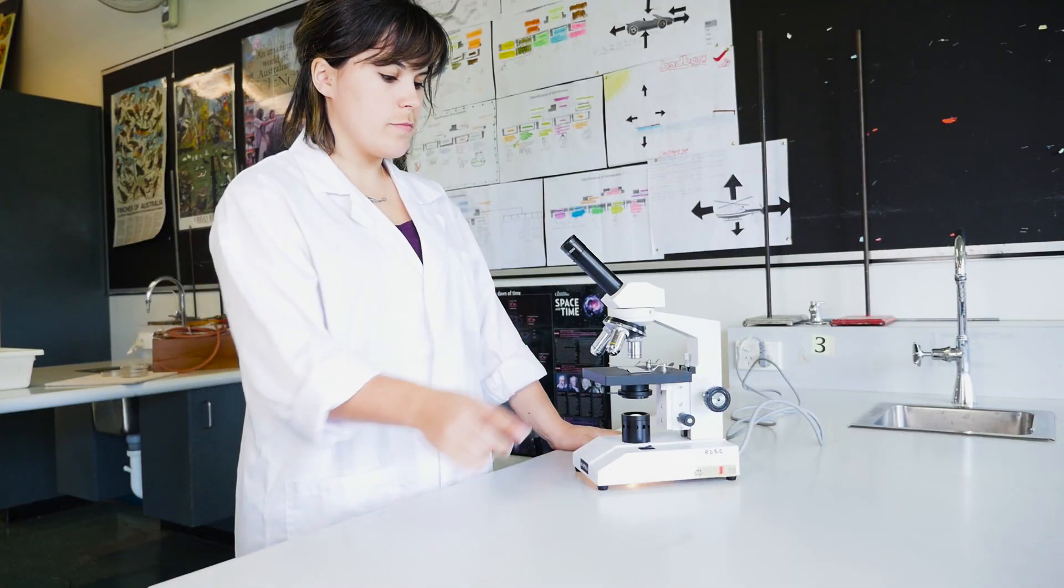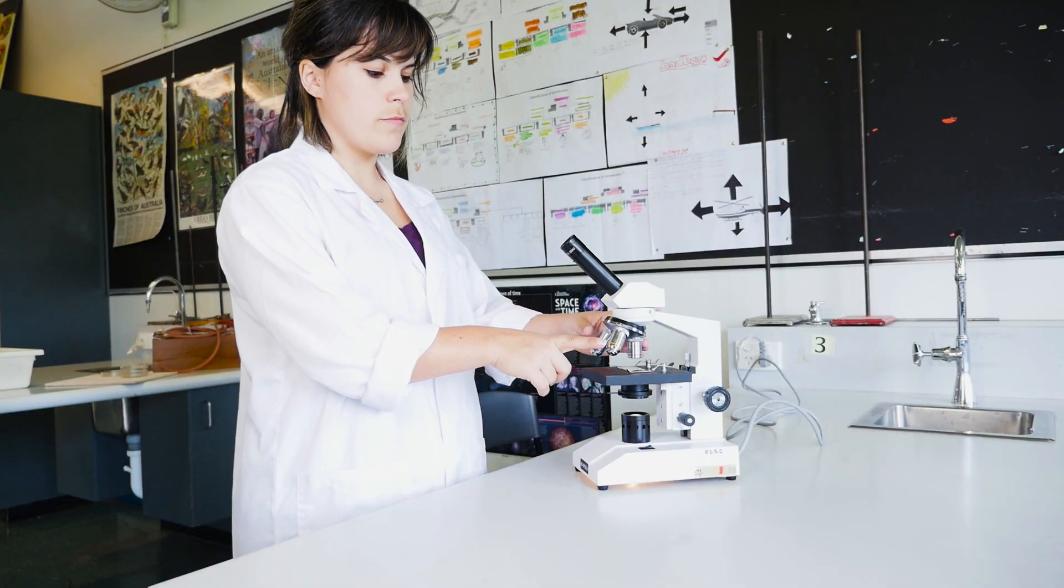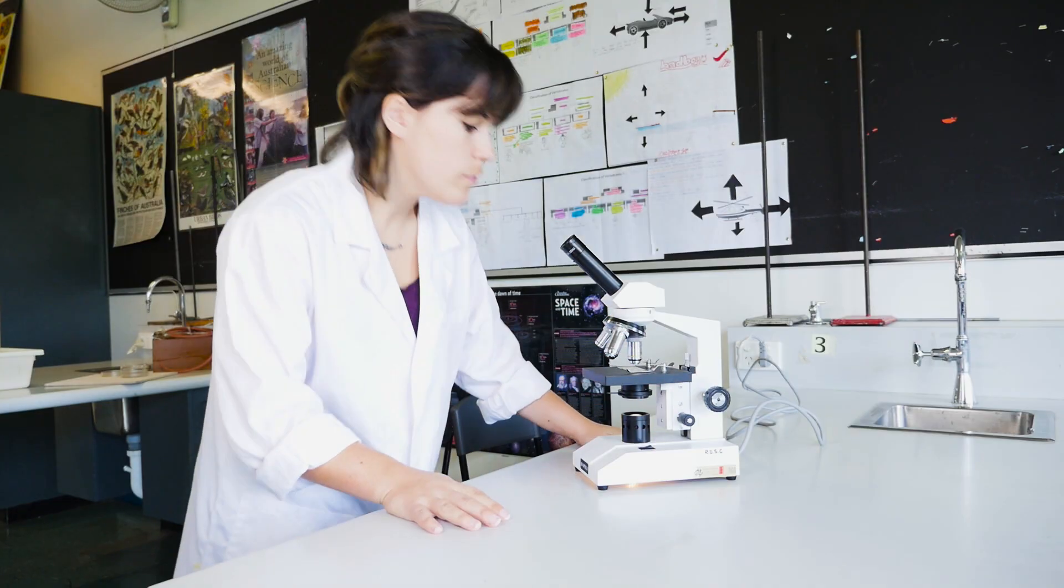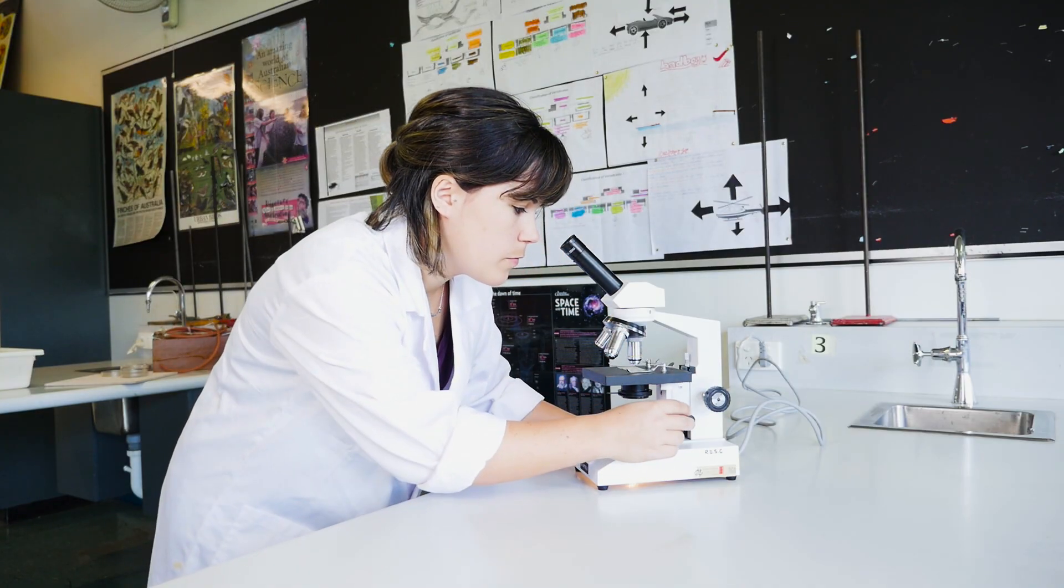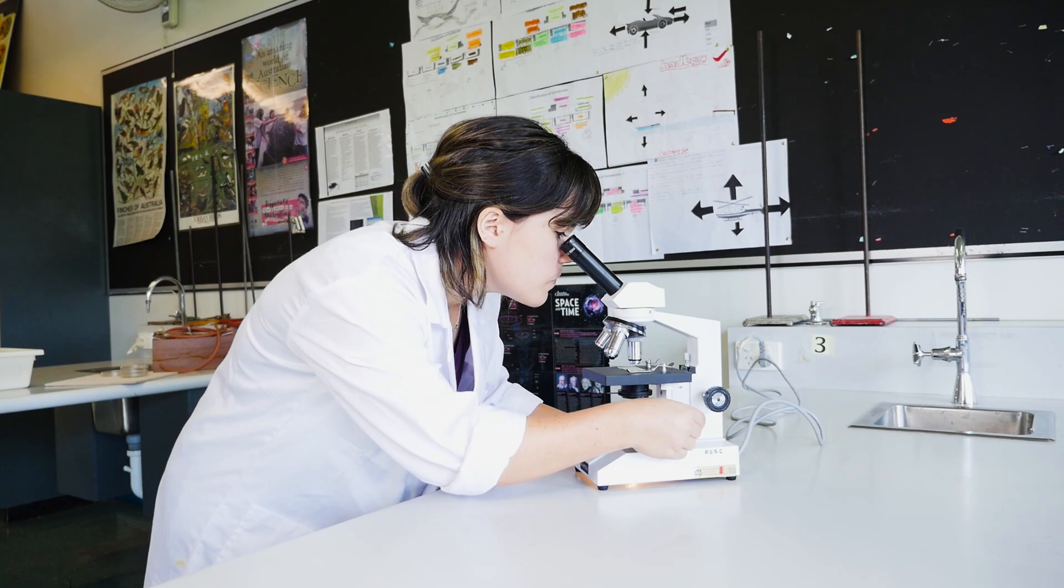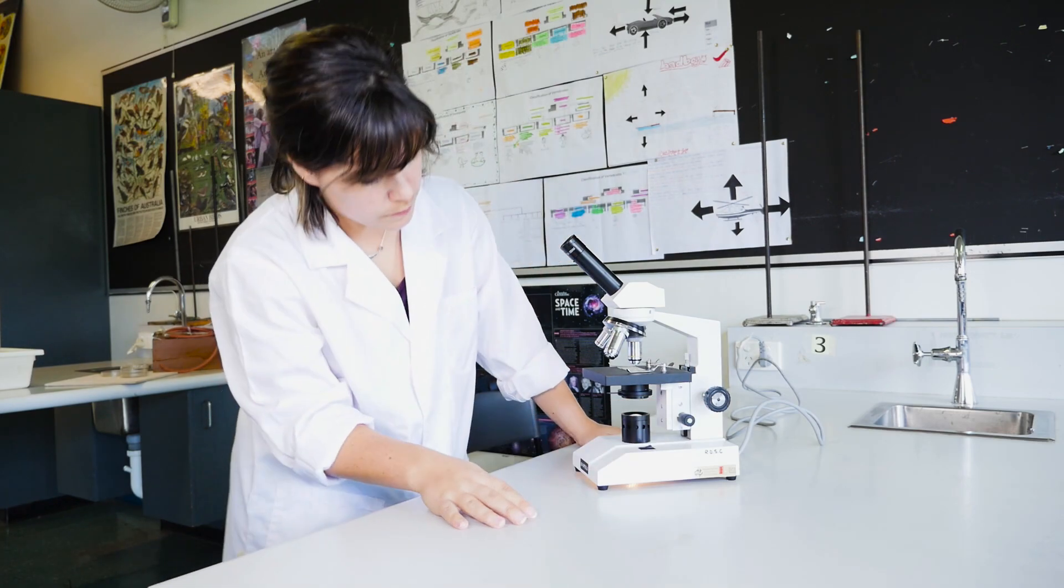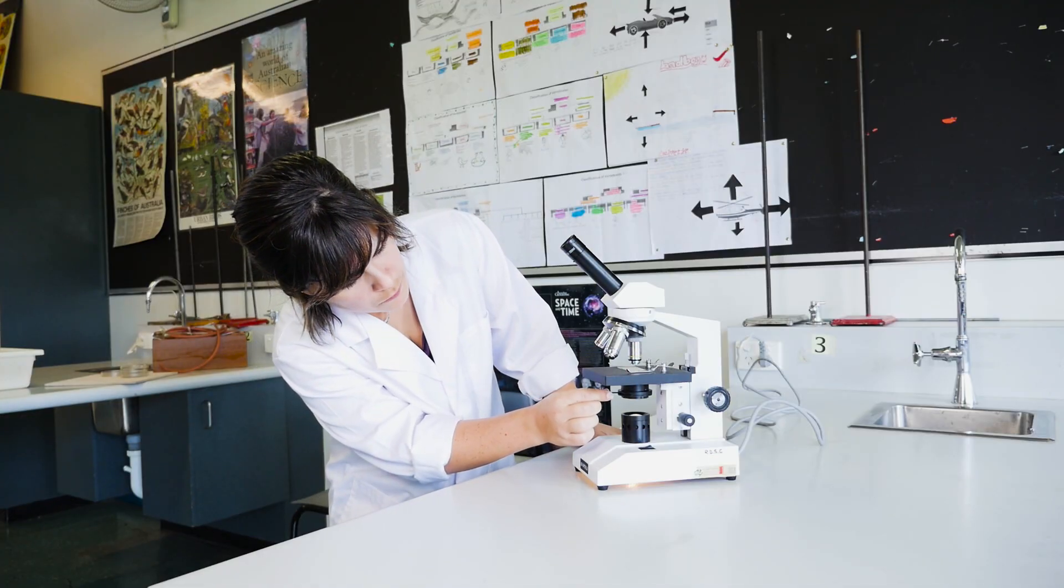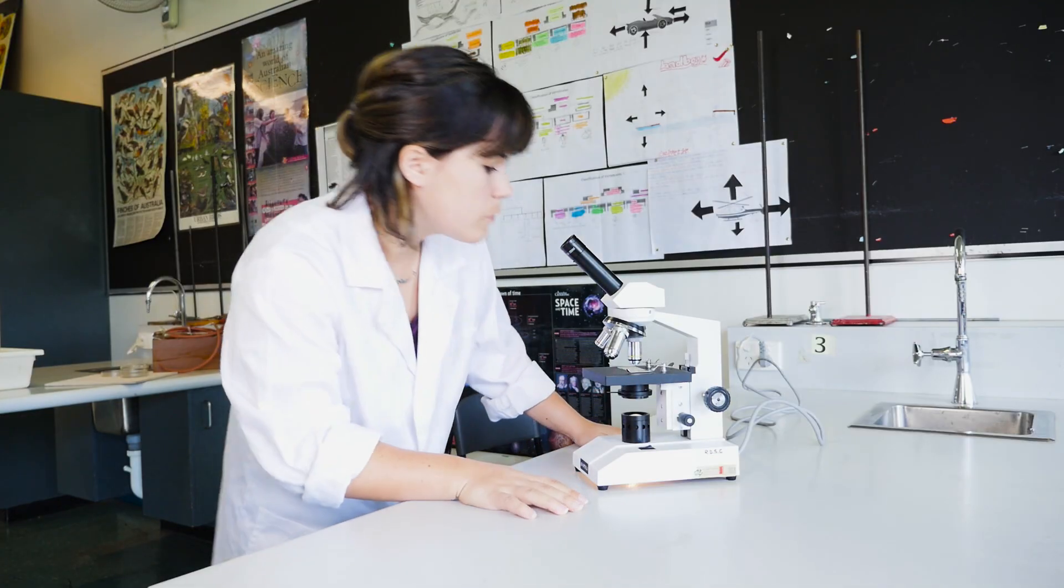Then follow the low to high rule and move to the next highest objective lens, 10. Your specimen should be nearly in focus and you should only need to adjust with the fine focus knob. You might also notice that the image gets darker. If it does, you can open the diaphragm to let a bit more light through.